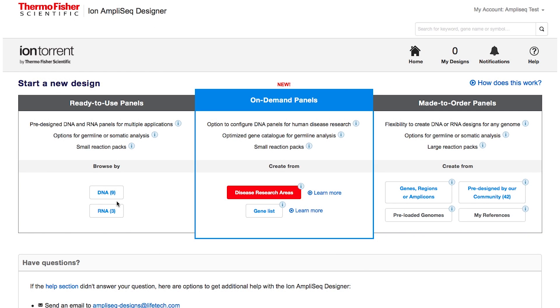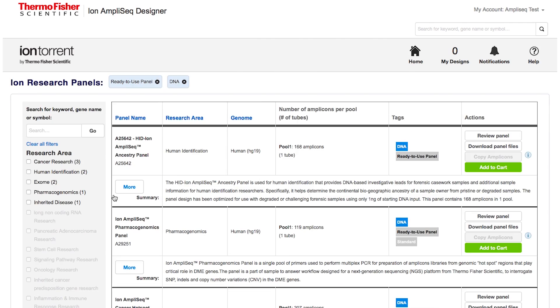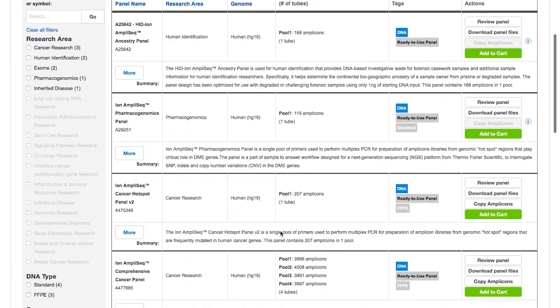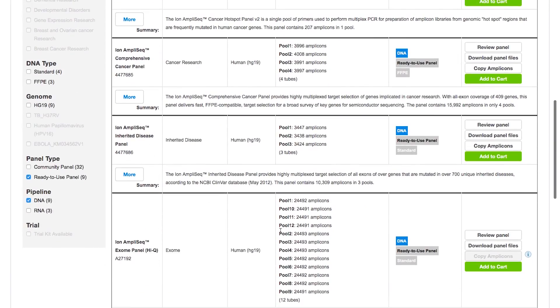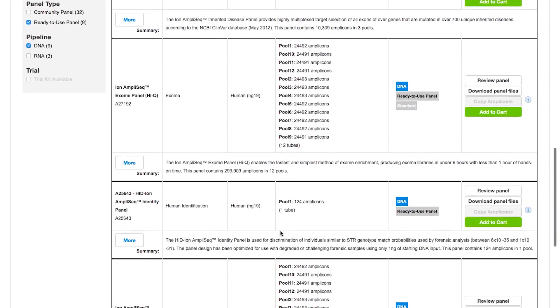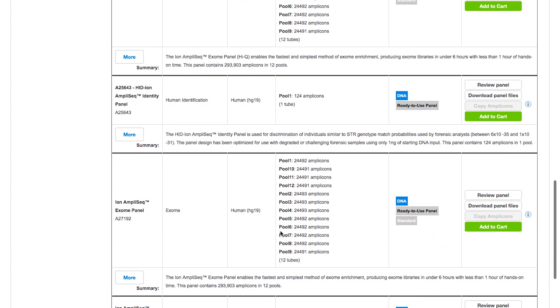By selecting the section called Ready to Use, you can select from our pre-designed and pre-tested panels that are available in practical pack sizes that fit your experimental needs.